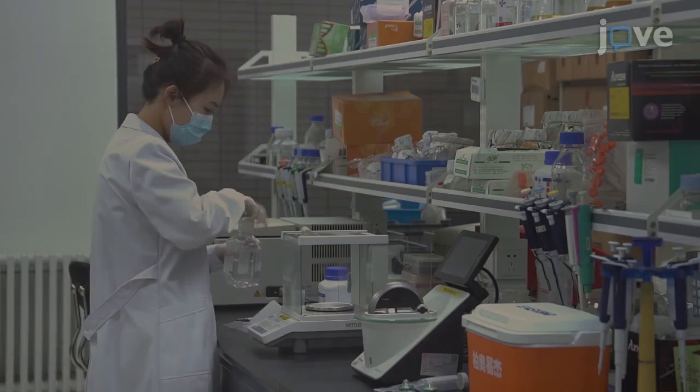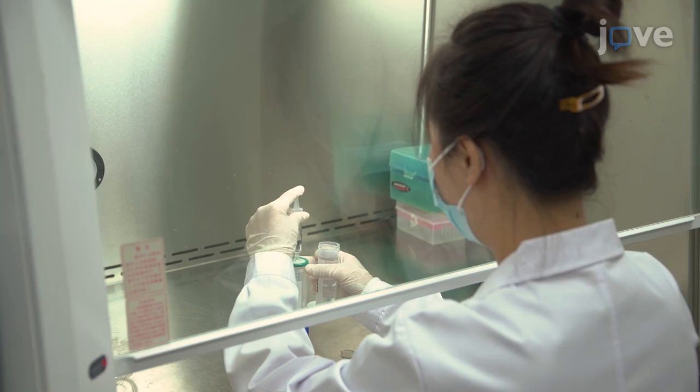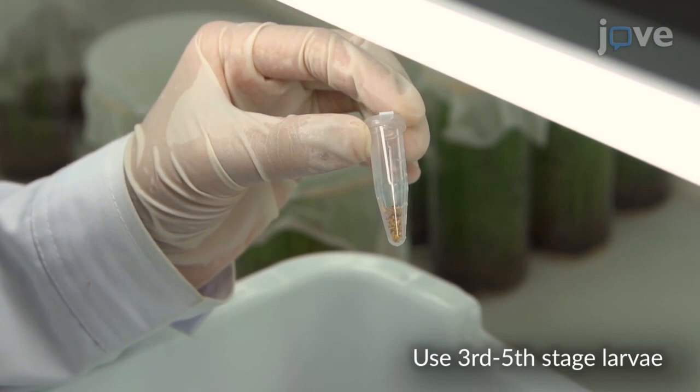Begin by preparing a 5% sucrose solution for the artificial diet and filter the solution through a 0.22 micron filter to remove bacterial contamination and impurities. Starve approximately 200 small brown plant hopper larvae for 3-5 hours before introducing them into a feeding chamber.